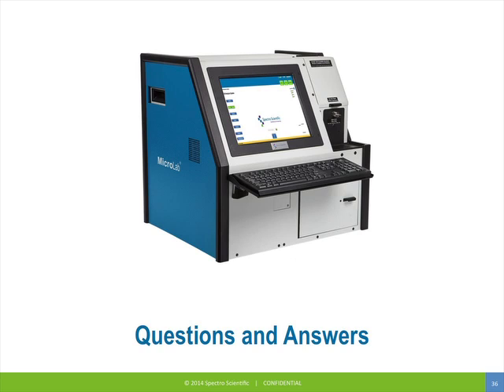So, how often is it required to calibrate or recalibrate the system? And maybe a wider question: how do you keep the system running and accurate and repeatable? Yeah, one of the nice things about the instrument is that it is set up to prompt the user as to when to run the standardization fluids, and it automatically cleans itself. It's really set up to walk the users through and know how many sample counts have been run before it has to be recalibrated. So that's all built into the system.